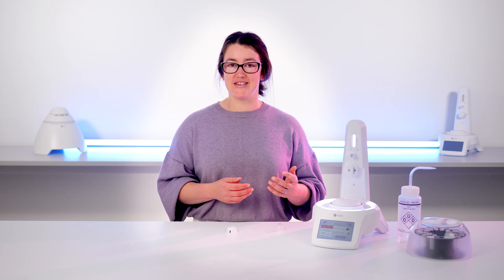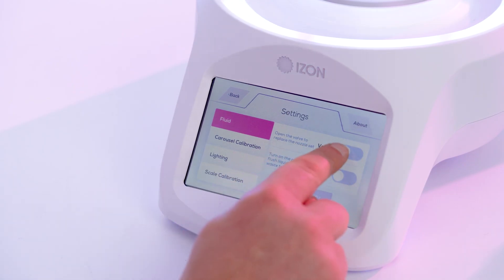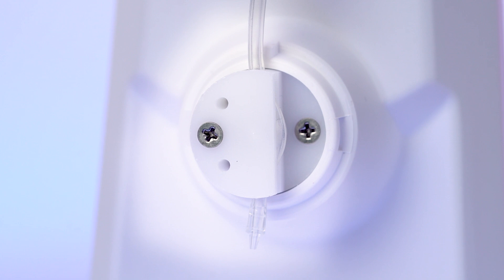When it comes to checking you've done it correctly, there are two steps. First, a visual check. You might want to pause this video now for a moment — we'll show you a close-up shot of correct placement. Note the alignment of the tubing. Toggle the valve open and closed in the settings menu and look from the side to see that the valve is pinching the tubing shut. And now, this is what incorrect fitting looks like. Note that the tubing is not aligned — it has curved around where the valve sits and therefore the valve will not be able to function properly.